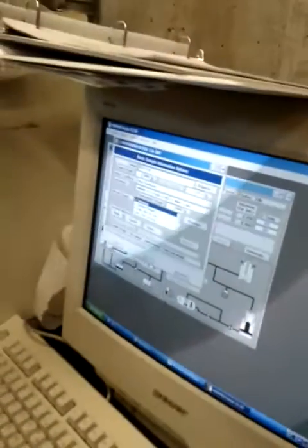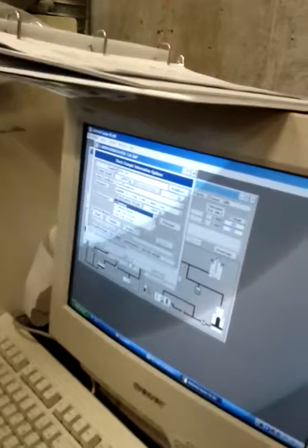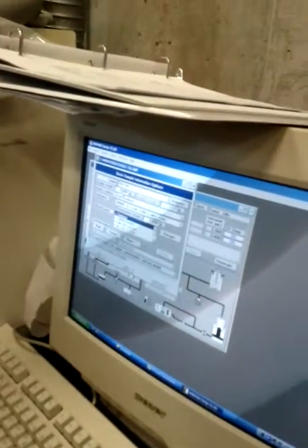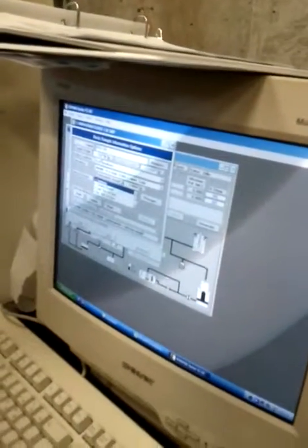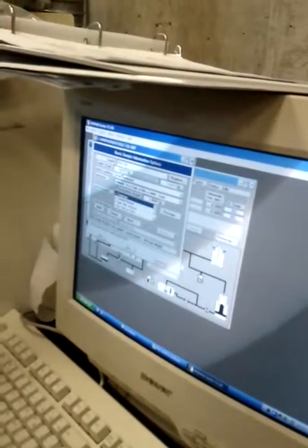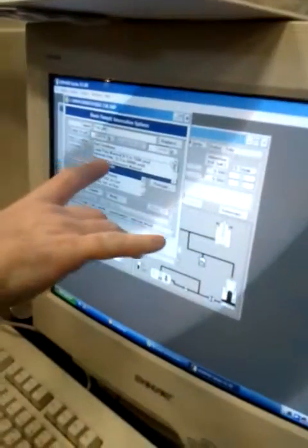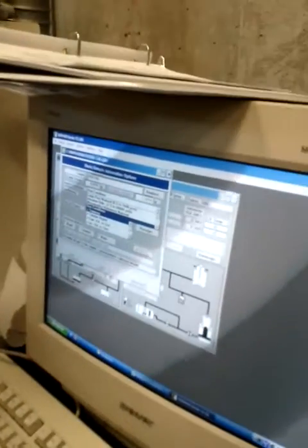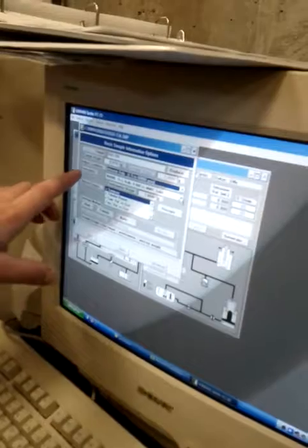It's a little bit weird, this thing, so we have to always put 0.8791. Okay, run condition, we have to put intrusion only, this one.